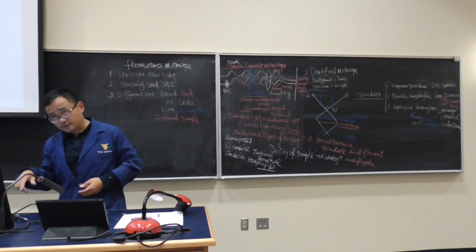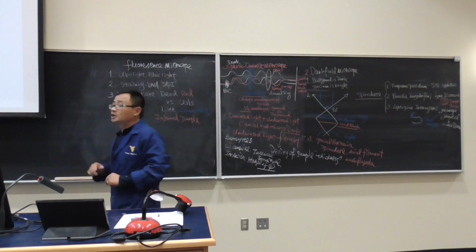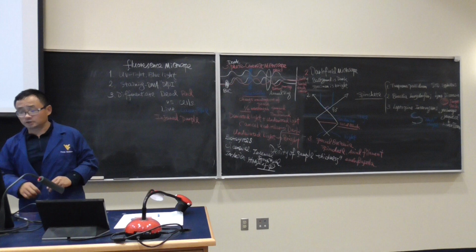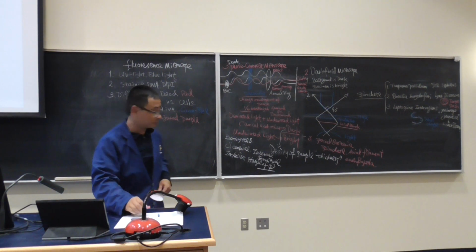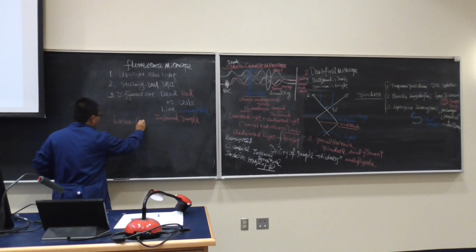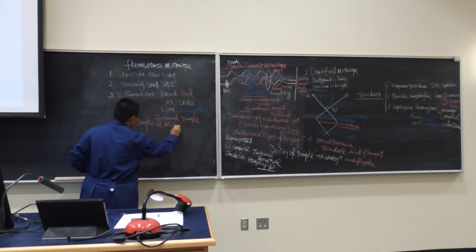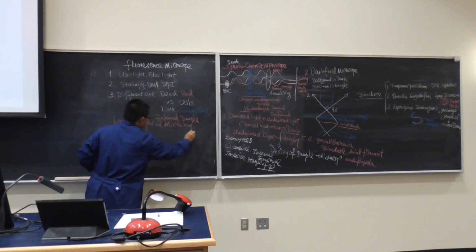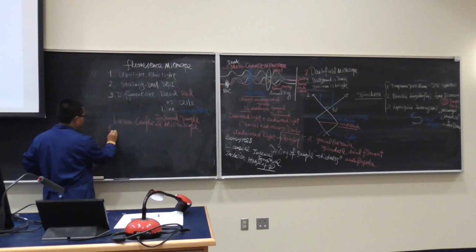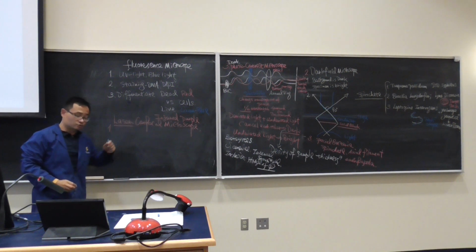Because the fluorescence microscope uses UV light and blue light as energy, so it's more focused. But people want to do it more focusing. They come out with laser confocal microscope. They come out with this guy. Laser confocal microscope, number one, you're going to use laser instead of using other energy resource.